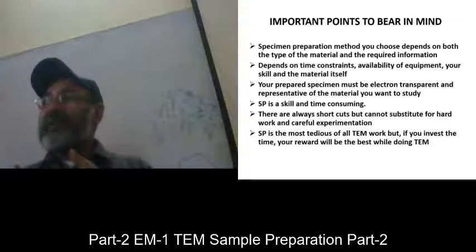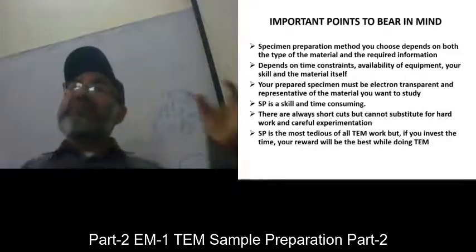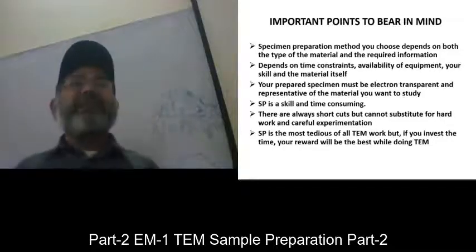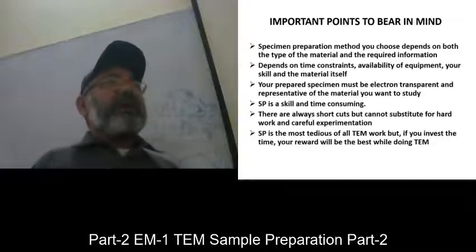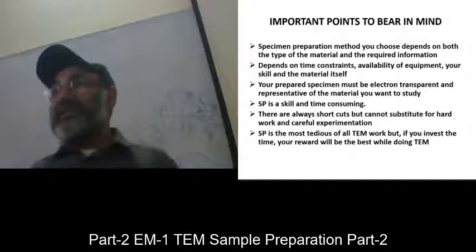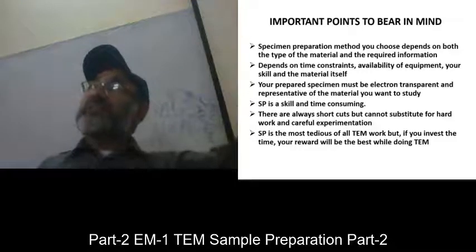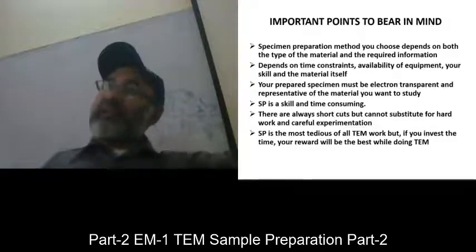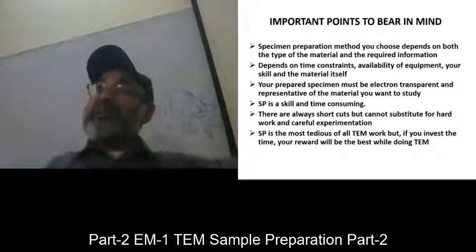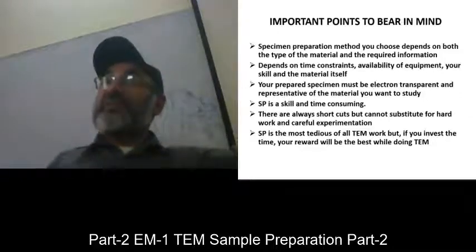If you used a different technique and I used a different technique, you used one set of parameters, I used another set of parameters. If you are using a microscope at 100 kV and its beam cannot transmit properly through the sample, and another person uses a 300 kV electron microscope, he sees more things than you saw in that sample, because the 100 kV microscope couldn't transmit through multiple regions of the sample, but the 300 kV beam passed through many regions, and that gives you 3 or 4 times more information.